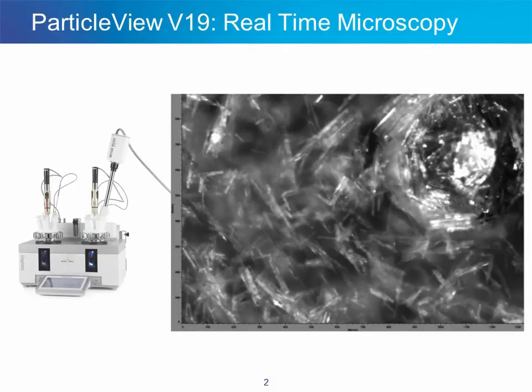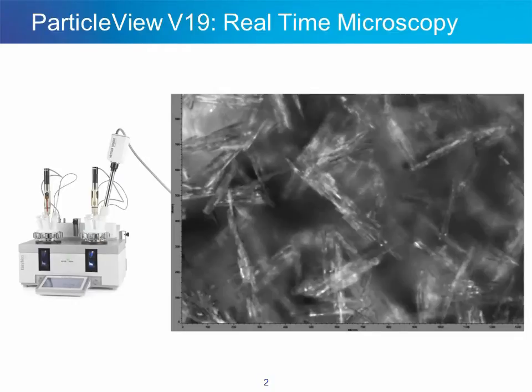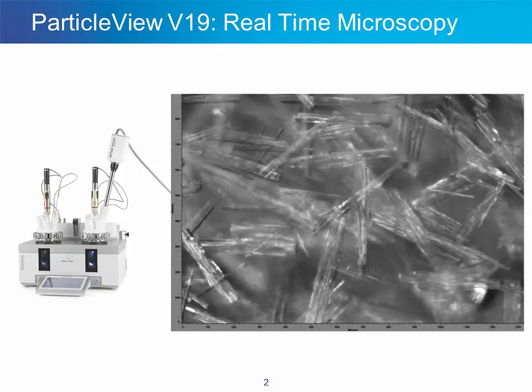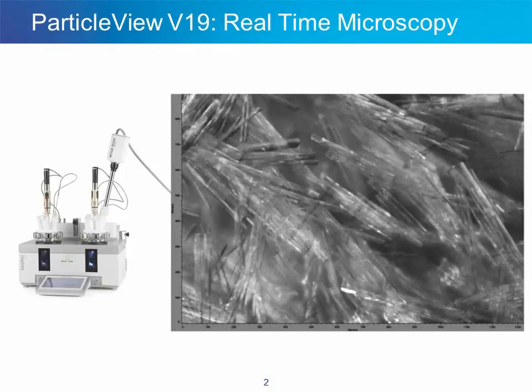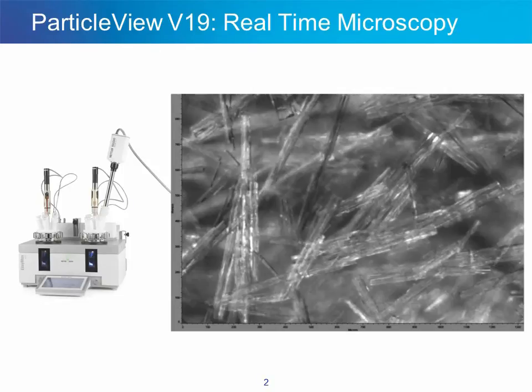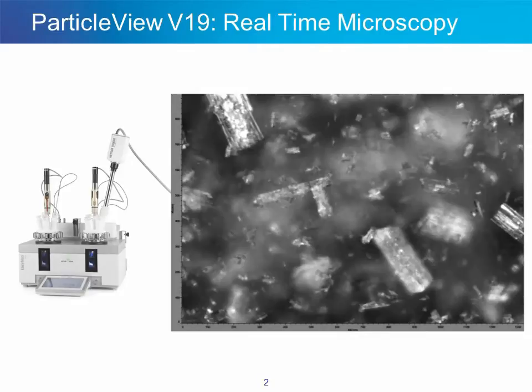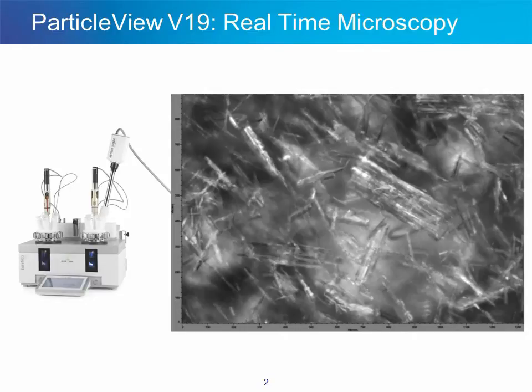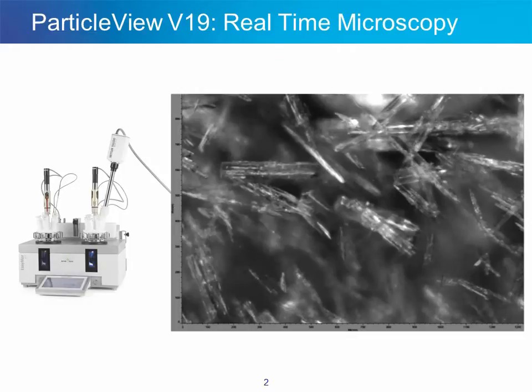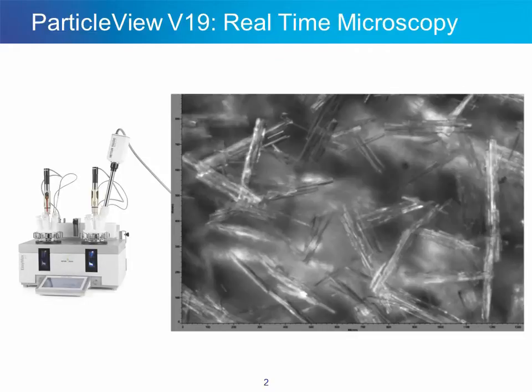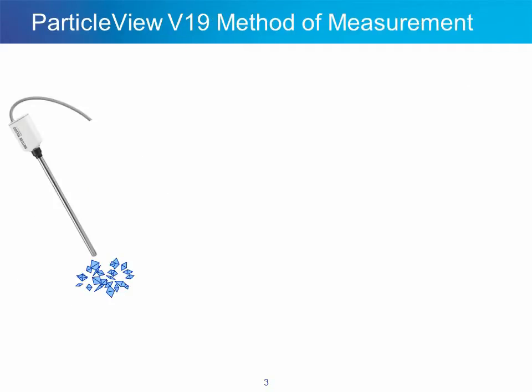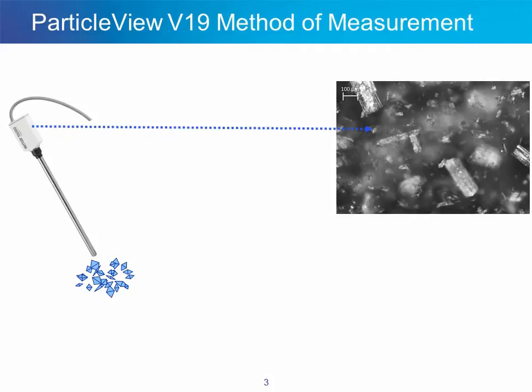ParticleView V19 is a probe-based real-time microscope that provides comprehensive process understanding for systems that involve particles, crystals, or droplets. In this video we can directly observe a crystallization process as it moves from the seeding point through a secondary nucleation event and into a growth phase where the crystals grow out into needle-shaped crystals. ParticleView V19 is a probe-based instrument that takes high-resolution microscope images of particles as they exist in process.